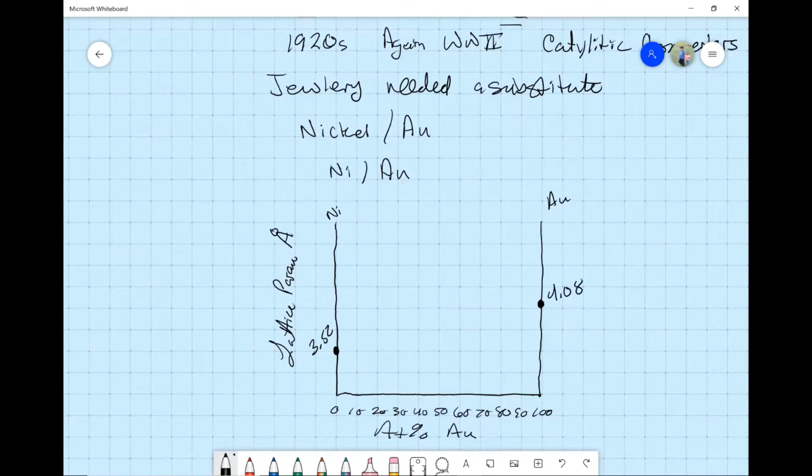All right. And so now I'm going to do the best I can to draw a straight line on my Surface tablet here. I'm just going to try to draw it. Not bad. All right. So we won't really work anything out because it's kind of a graphical approximation if you think about it. But here 50% falls about here, and 3.52, let's just say this is 3.75. Let's just guess that this is 3.8.